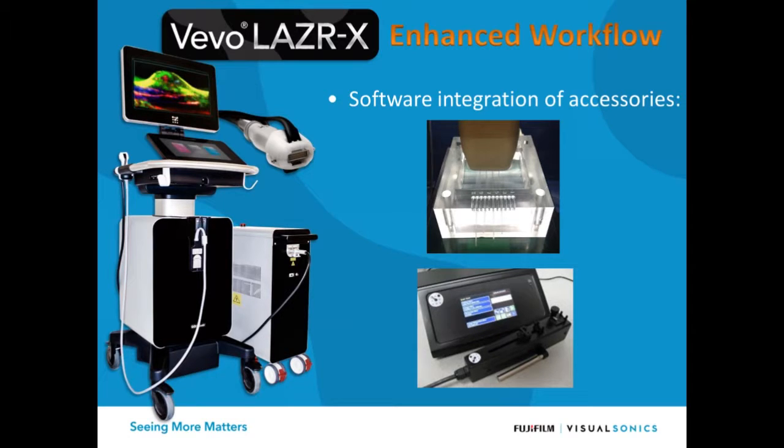So really nice as far as the workflow, and also integrating some of the hardware accessories that we've designed. We've designed a phantom, so for those of you doing a lot of contrast agent work, you want to characterize your contrast agent in a phantom in vitro before going in vivo. We've designed this Vevo Phantom imaging dish across which we can string tubes, and you inject your contrast agent into the tubes and do imaging. I don't have a screenshot of it here, but we've got an interface which allows easy acquisition and quantification of those contrast agents using this piece of hardware.